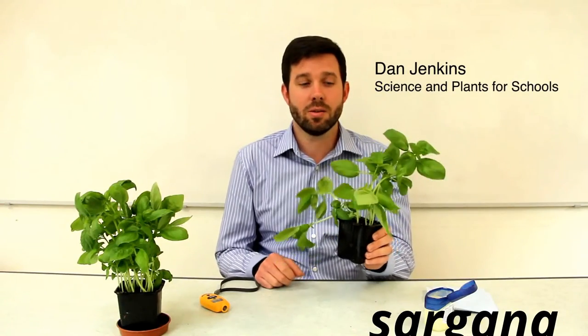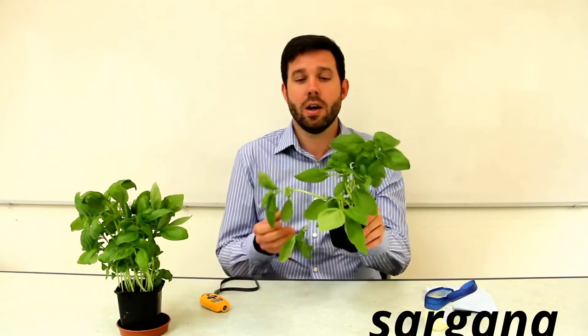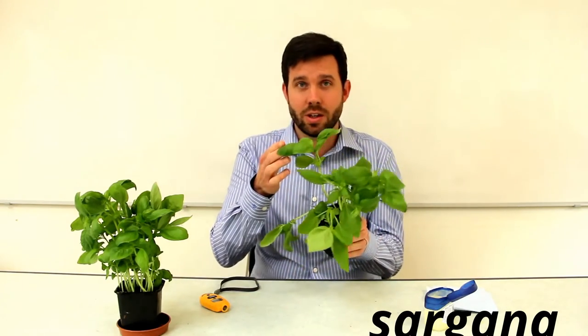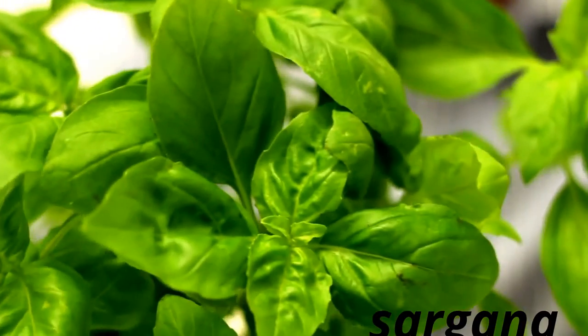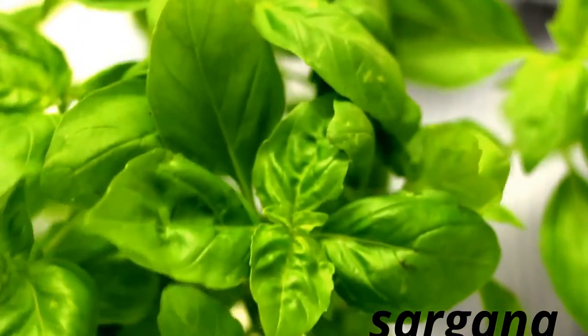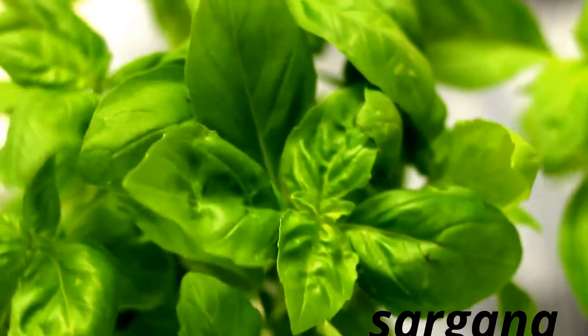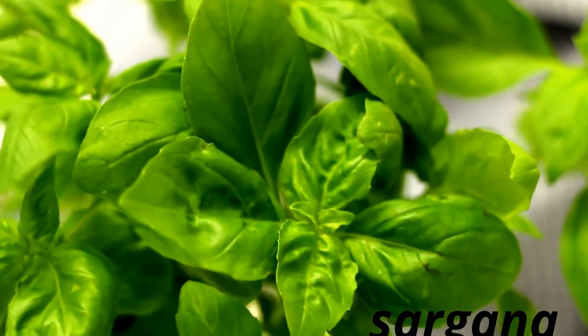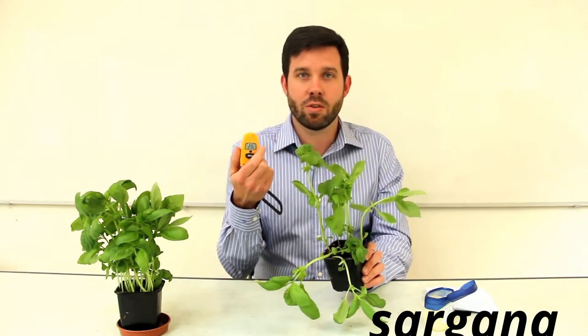Welcome to Plants for Schools. Today I'm going to show you another easy and quick practical to use with plants. We're looking at the basil plant and water transport for post-16 level teaching. This practical is a really good way to get an investigation into stomata and the transpiration stream at post-16 level, and we're using devices called infrared thermometers.